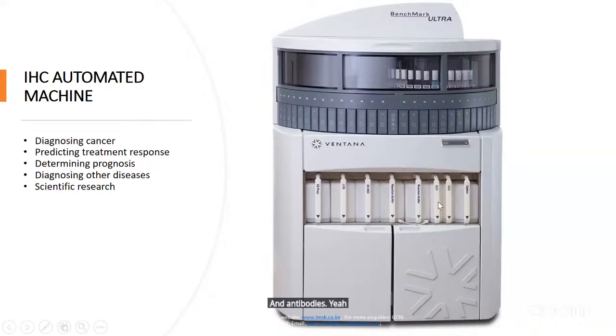And then here, these are the bulk solutions, the ones that are used to wash the slides, the liquid coverslippers. Here is where the bulk solutions are. And then this door, you can open it, and this is where the waste is. So you're able to check when the waste container is full, you can just discard it. And there are normally two.